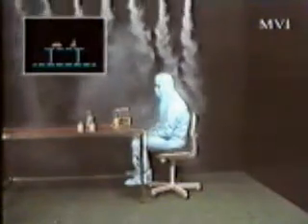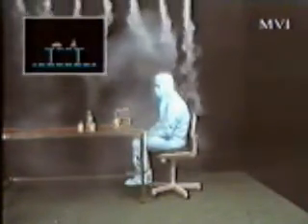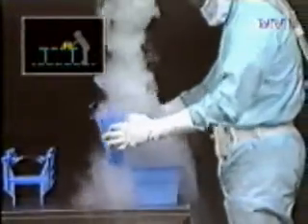All equipment used in cleanrooms should be designed to allow air to pass through it rather than bouncing off it and breaking up. The use and placement of heat sources in cleanrooms should be considered very carefully in the sense of random or continuous turbulence. And people should be trained to move and behave in such a way as to reduce to the absolute minimum the turbulence that they will inevitably cause.